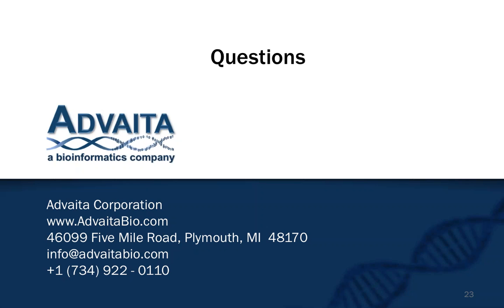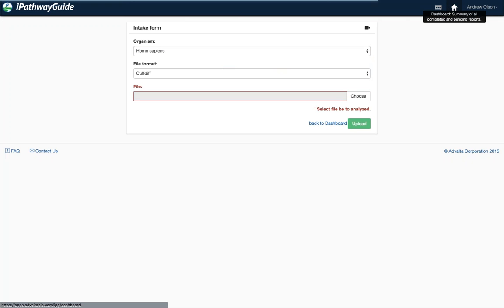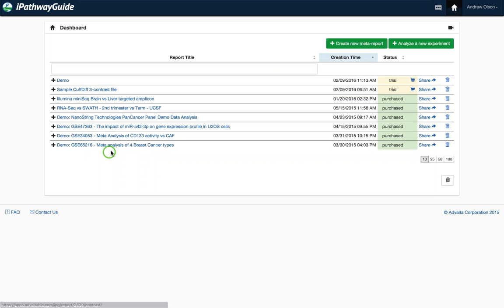Thanks. Another question is, for the corrected p-value, when it is less than 1, is it still significant or not? And moreover, when the digits are shown in black bold compared to green ones, what does that mean? Oh, so that's a good one. Let me go back here to the application, and I think that's probably the best one to show is in this meta-analysis.